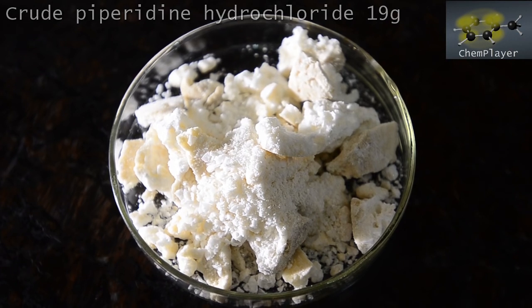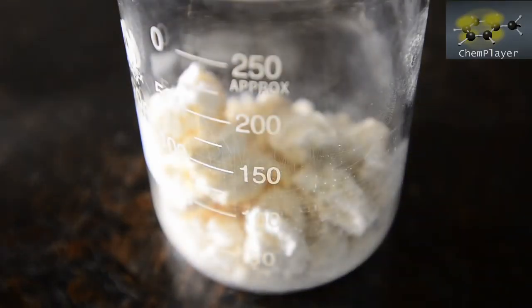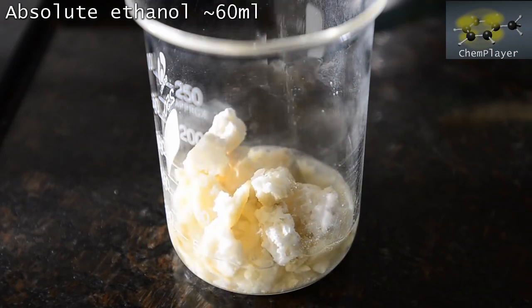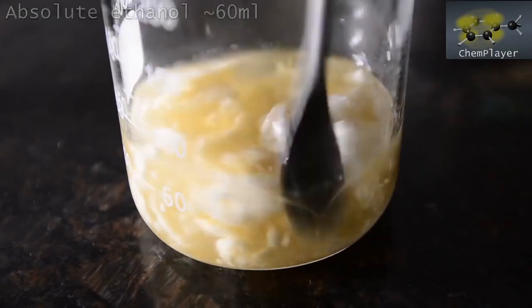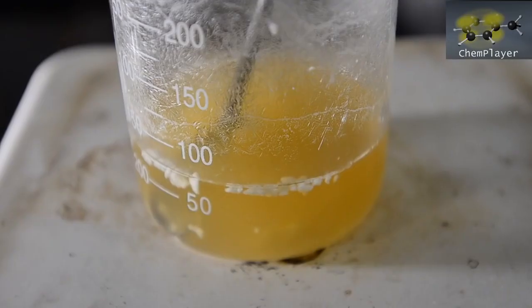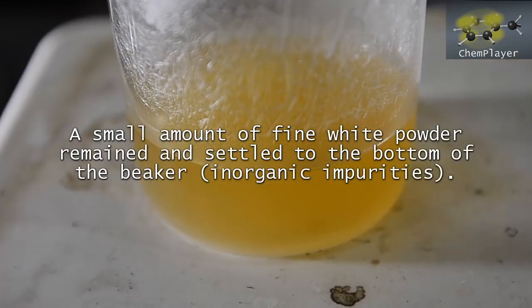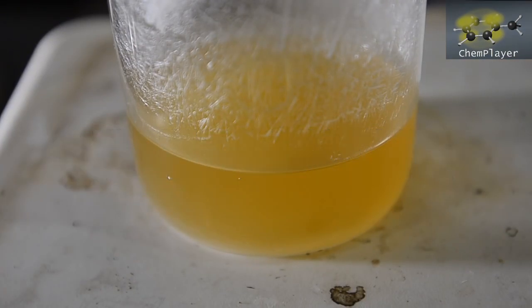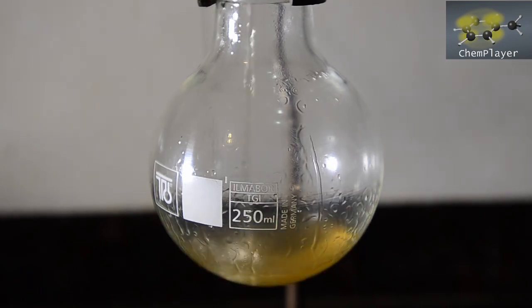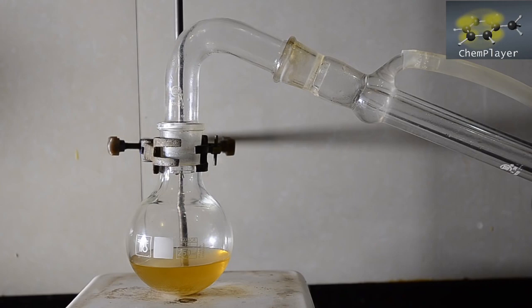To take it up a level of purity, we placed the solid into a beaker and then added around 60 ml of absolute ethanol. The idea was that this would dissolve the product but not the sodium chloride or other inorganic salts present. On heating, pretty much everything dissolved apart from a very small amount of white powder remaining in the bottom of the beaker. We let this rest and then decanted the clear ethanol solution into a clean dry flask, and then set up to distill off the ethanol, and hopefully also dry the product in the process.